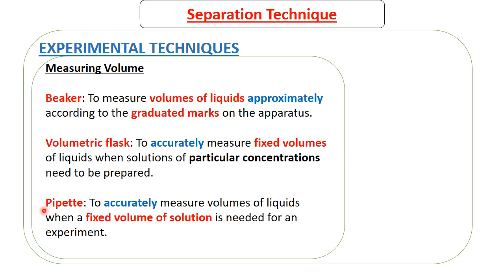Just like the volumetric flask, but the flask is for particular concentration, while this one is for fixed volume of solutions.